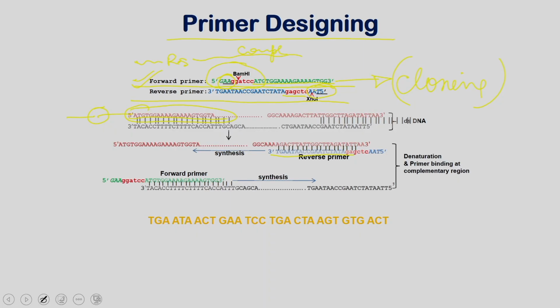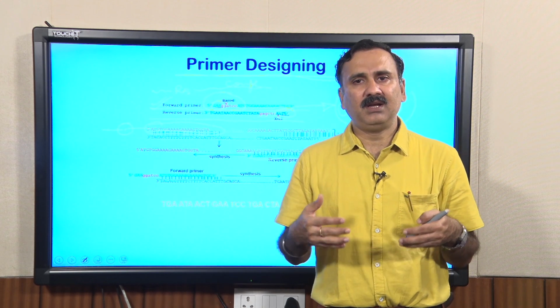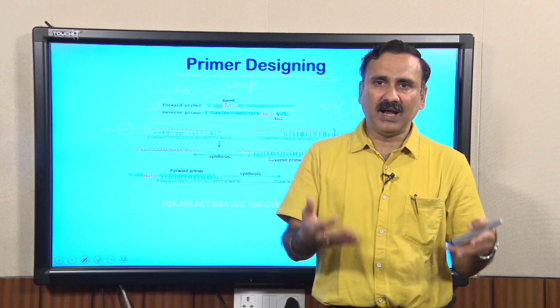There are multiple things the students might have discussed, how to analyze and how to verify and all that. So this is all about primer designing and how you can synthesize or design the primers utilizing the different softwares, and I hope you have understood the whole process, and it is actually going to help you in designing primers in your lab.